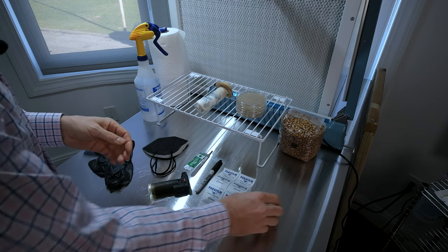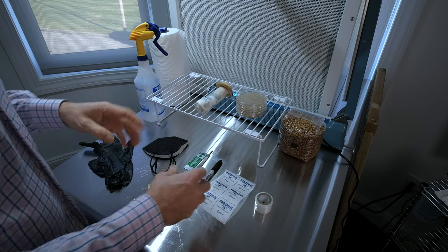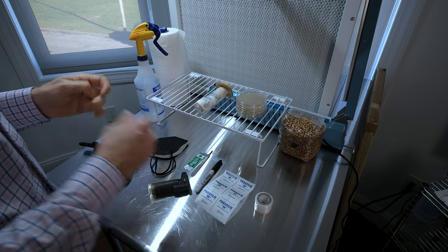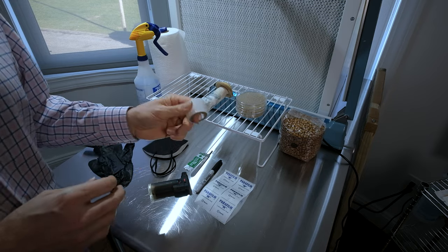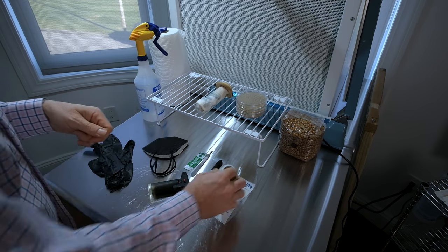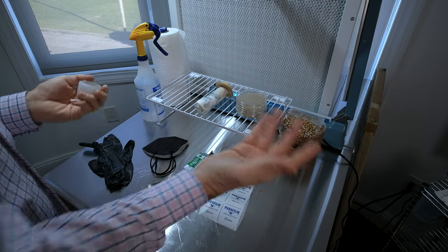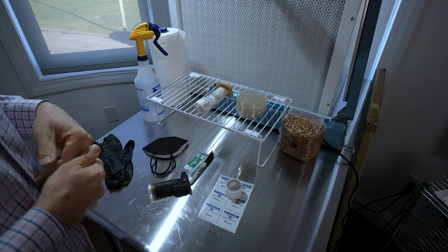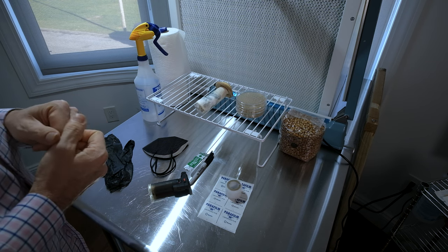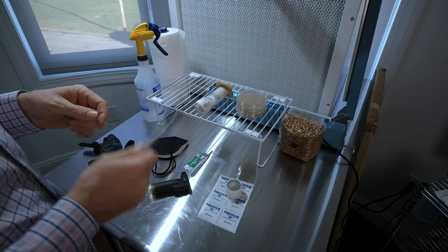You'll need parafilm or grafting tape to seal your plates afterwards. I used parafilm for a long time but it's expensive, it sticks together when plates are stacked, and it dries out and cracks. I've completely switched to grafting tape — it's like saran wrap on a small roll, it's breathable, and significantly cheaper. I'll throw links in the comments. Other than that, just a Sharpie to label your plates, because labeling is key — it's very easy to mix up genetics.